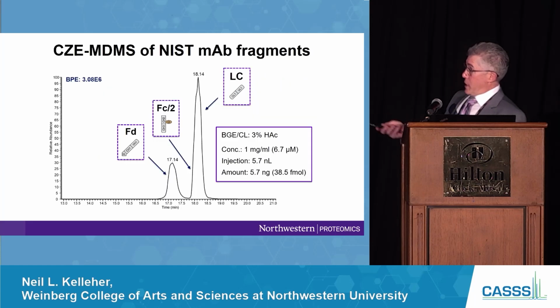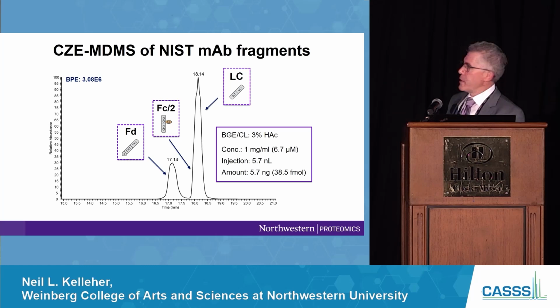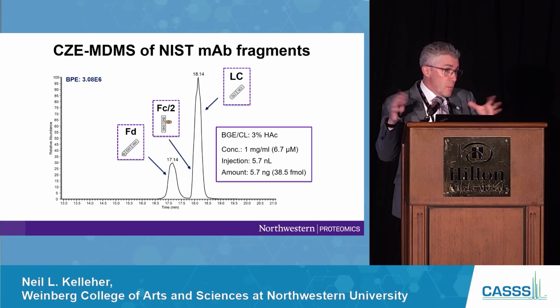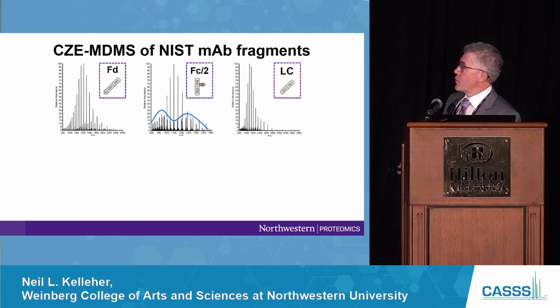So in a CZE top-down, middle-down experiment, let me show you some fragmentation data. I think intacts are very well known to the community. Doing actual fragmentation and getting to the fragment ions, that's the step that I think still there's trepidation about. But the tools are getting there.